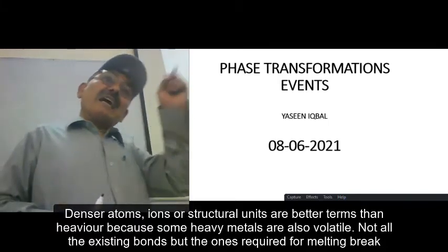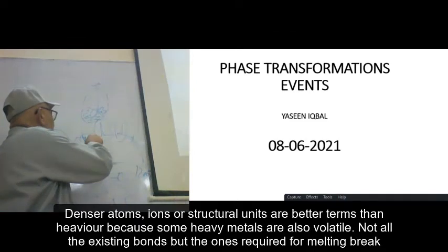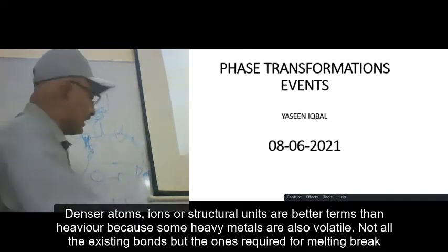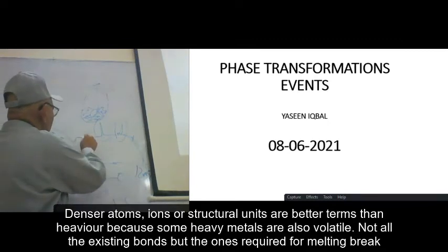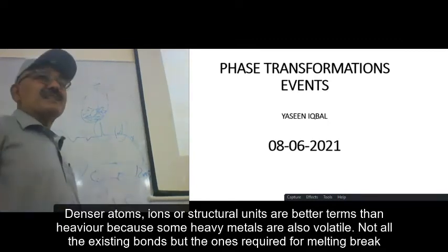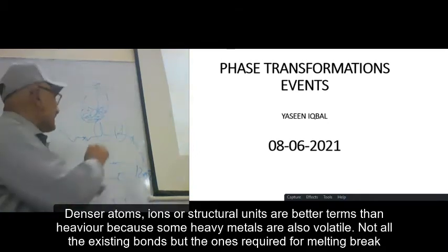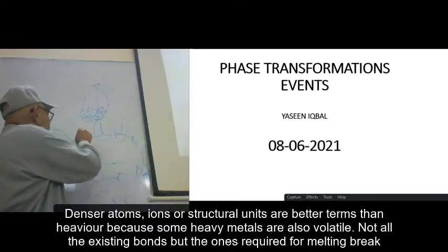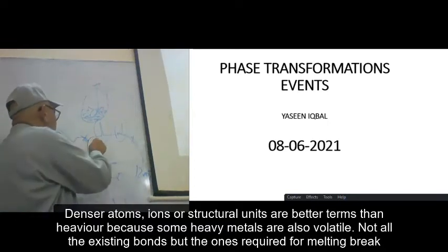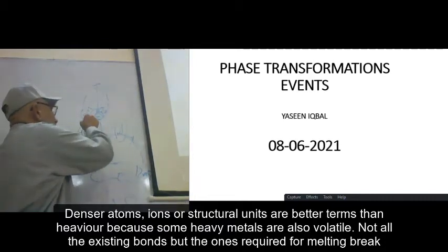So to avoid that, what people do, people heat the material. If this was, for example, the glass transition temperature, people select this place, not this place, but this place. For example, if this was 450, this will be about 400.